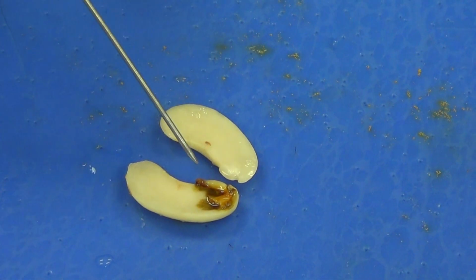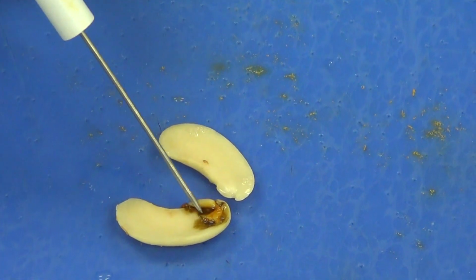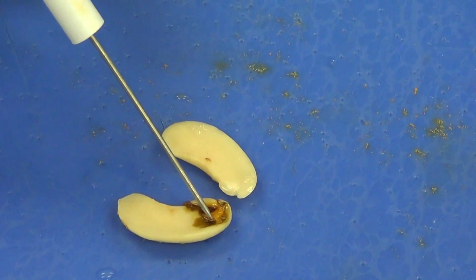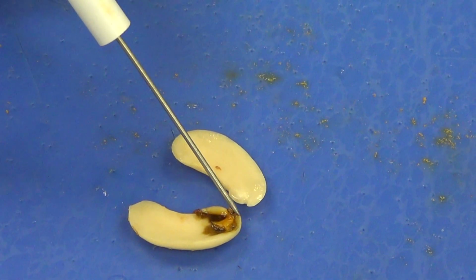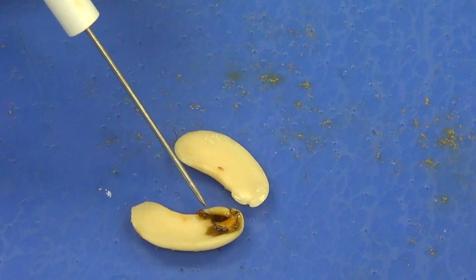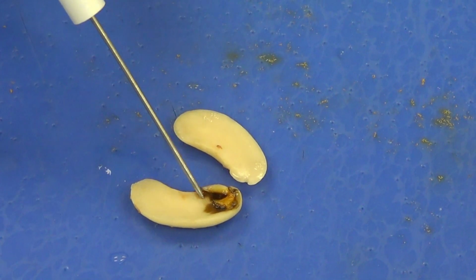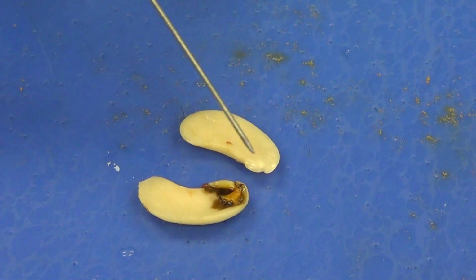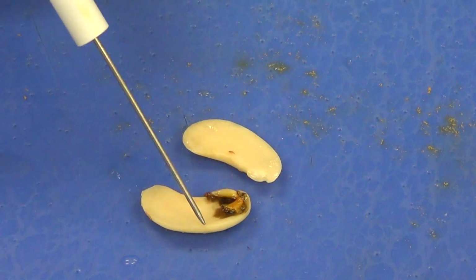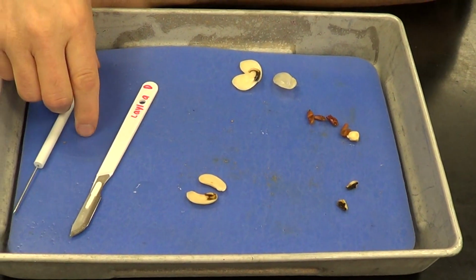And if we look in here, you can see the embryo right here. Here's the embryo, and then you can see the top part of that embryo right there, that epicotyl or plumule. The middle third is going to be the hypocotyl, and the lower third is going to be the radicle. And again, all of this other area right here is going to be our cotyledon, all cotyledon, which is going to be our future food for our developing embryo. And that's going to be it for the bean seed dissection.